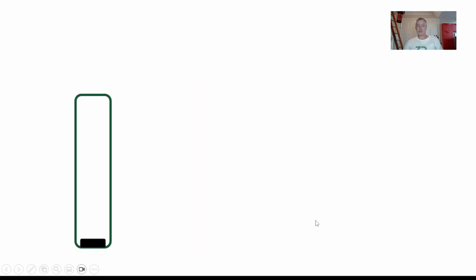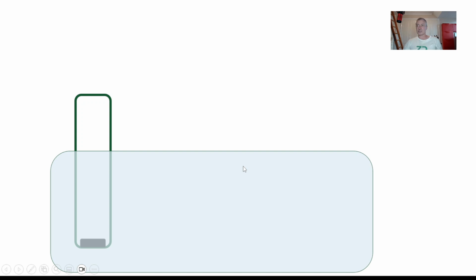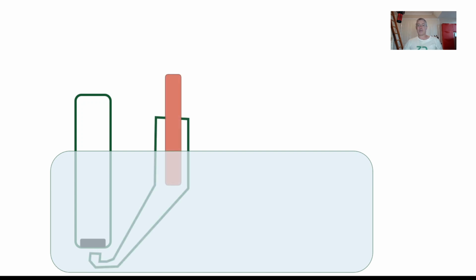This whole conversation about IR drop is often told from the perspective of, I've got this disc electrode. It can be gold, platinum, carbon. I'm in a solution. I have what's called a Luggin capillary, a horrible term, but it's a glass object in which you have a reference electrode and you're trying to bring the tip of this capillary as close to the working electrode as possible.